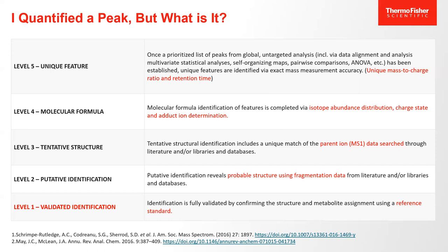That is different than a reference standard. A reference standard will have infrared, NMR, okay, activity measurements. It'll have other pieces of biochemical or analytical chemistry techniques to validate its structure. And in the end, we agree upon its structure as that identical particular chemical, and we assign a purity to say how good is it as a reference standard. That's when you change from buying from Sigma to buying from Seralliant or from Cambridge Isotopes Labs. Now you're buying certified reference standards. And unfortunately, your cost goes way up, okay?